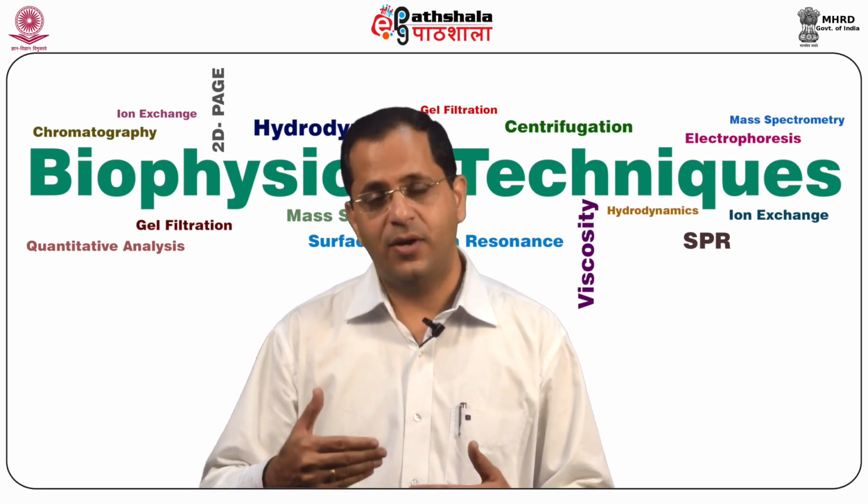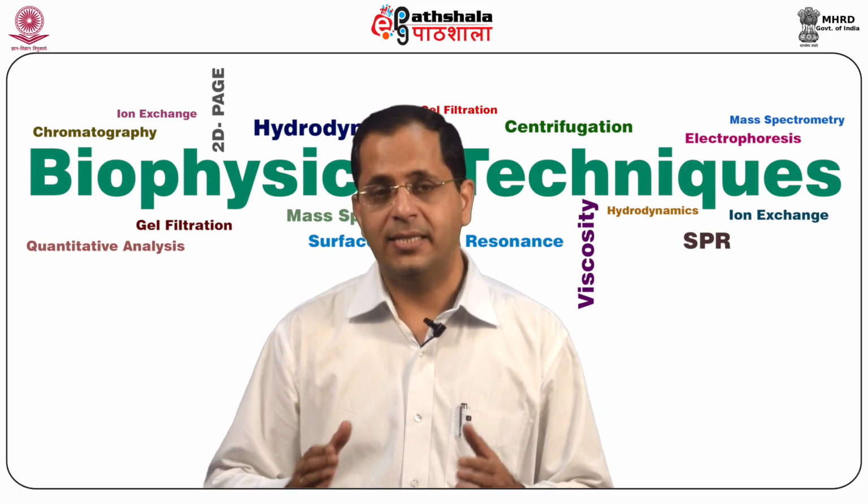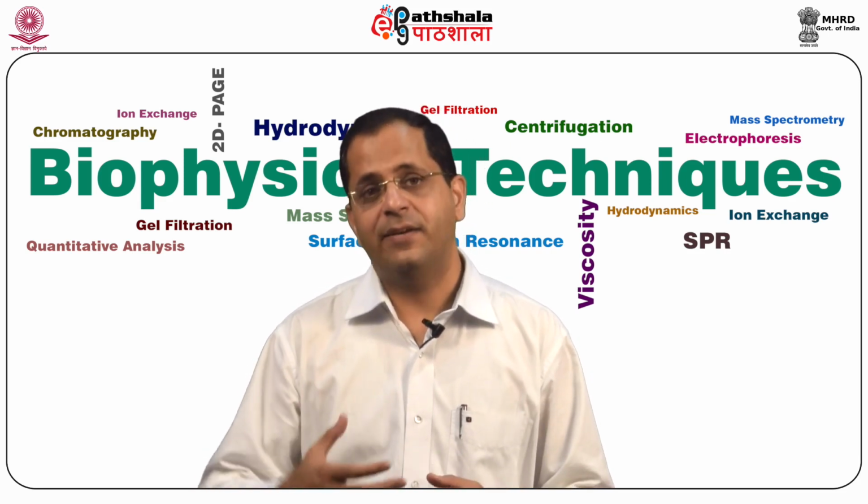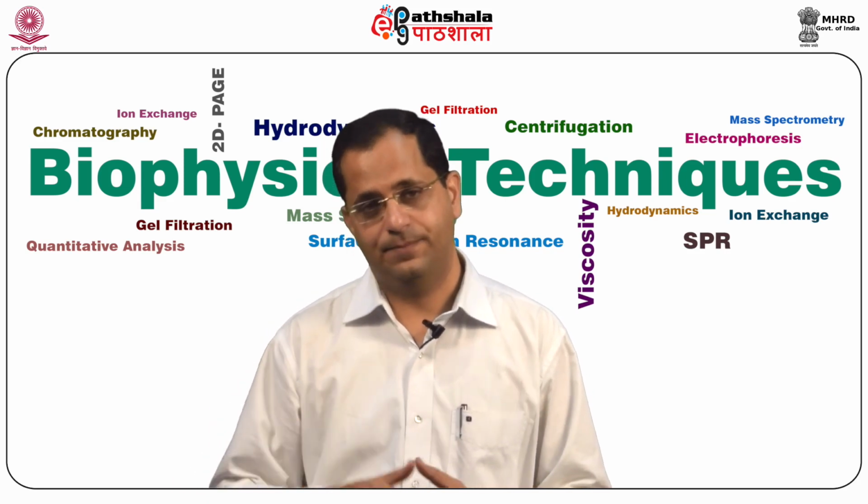One last disadvantage of this particular technique is the experiment is as good as the staining technique, which dictates the sensitivity.